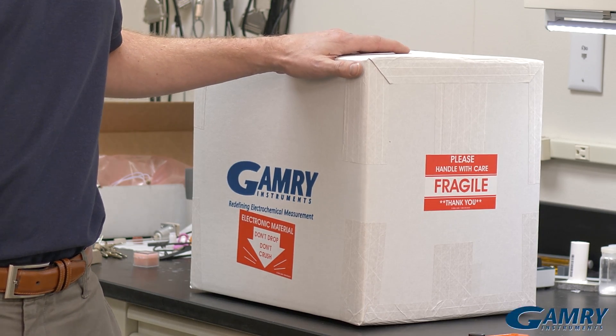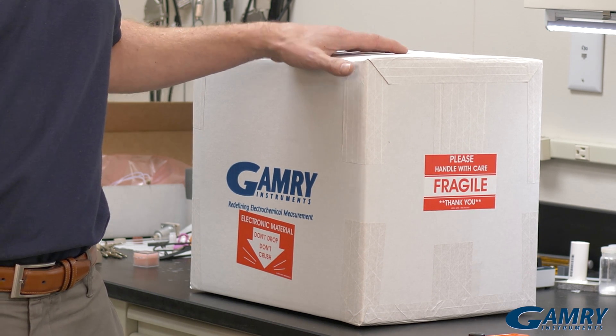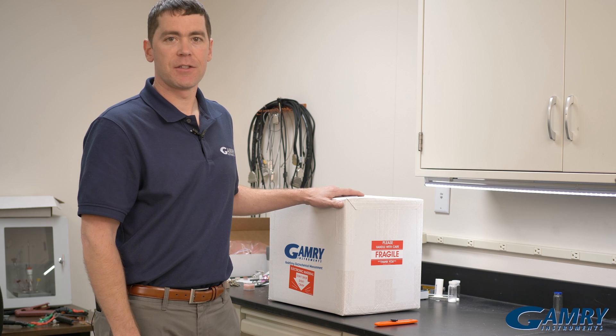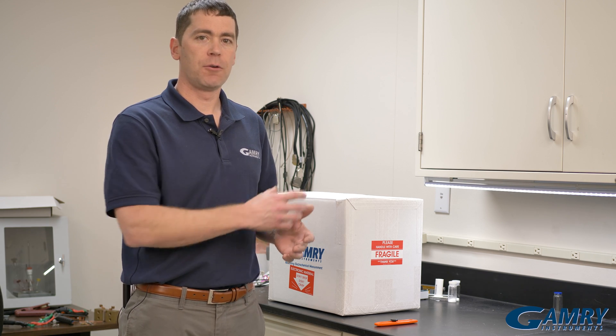Hi, I'm Chris Beasley with Gamry Instruments, and in this short video I'm going to walk you through unboxing a Gamry Reference 600 Plus potentiostat. All of our potentiostats are boxed similarly, so what I show you here applies to all of our potentiostats. The main goal here is to explain the pieces that come inside this box.